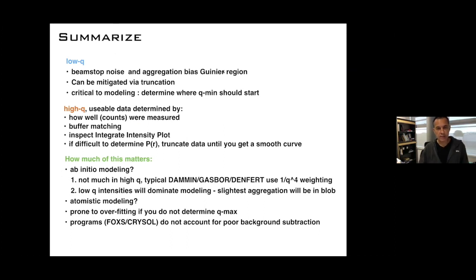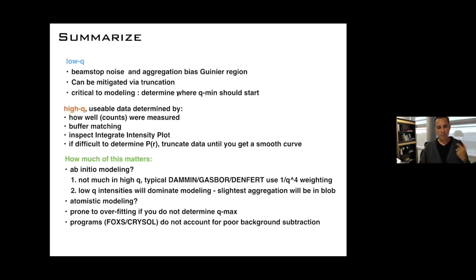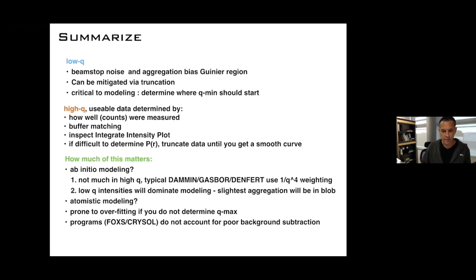To summarize: low-q issues include beam stop noise and aggregation, which bias the Guinier region. This can be mitigated by truncation, but it still causes a bias. This is critical for modeling — programs like DAMMIF, GASBOR, and DENFERT really bias the low-q intensities because they do 1/q^4 weighting. Even a slight amount of aggregation can cause slight elongation of the model.